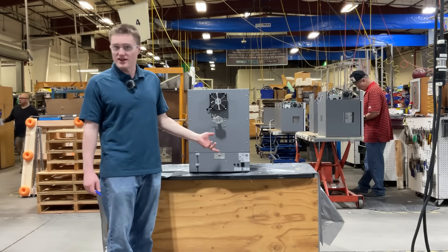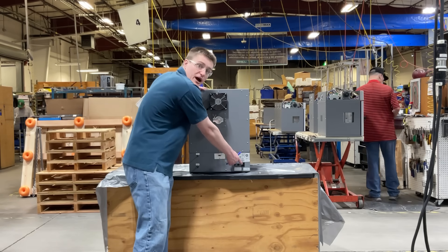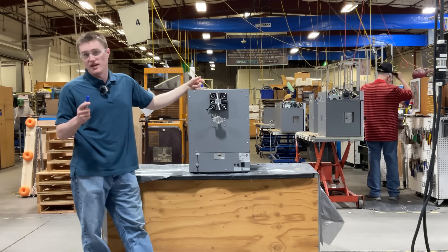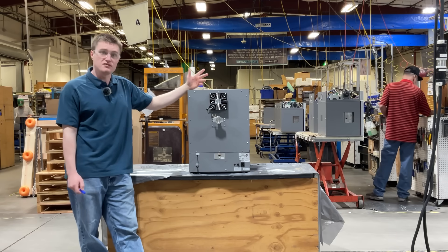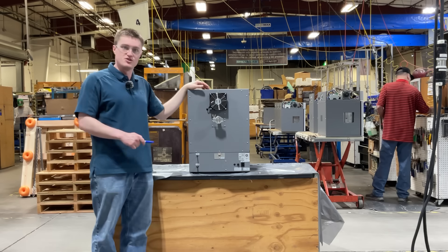Now let's take a look at the back side of the unit. Located in the lower right corner is the main power inlet. Each unit is included with a compatible power cord that must be connected to a properly grounded electrical outlet. For information related to electrical safety, as well as installation instructions such as clearances, please refer to the user manual.